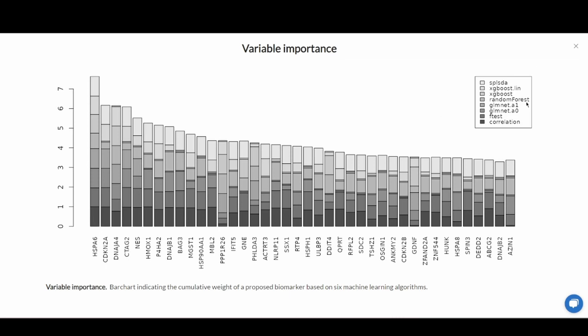In particular, heat shock protein A6 was correctly identified as a biomarker by all six machine learning algorithms.